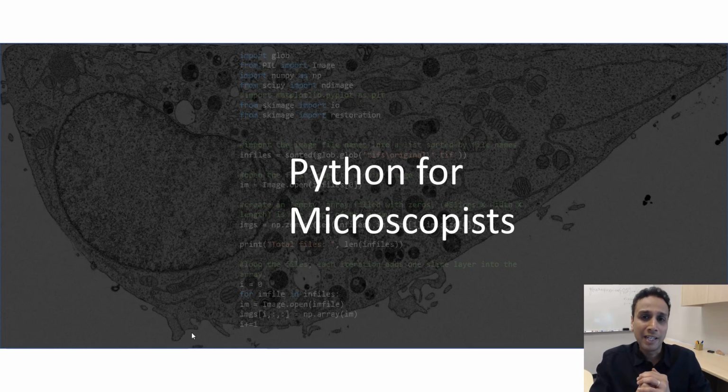But what I should also mention is that digital filters are nothing but a convolution between a kernel and your image. When I say a convolution, that's nothing but a multiplication of two arrays that are of different size. A kernel is, let's say, a small matrix, say a 3 by 3 matrix with some numbers in there, and your image is a much larger matrix with a whole bunch of numbers in there also. So we do this convolution by multiplying these two arrays.